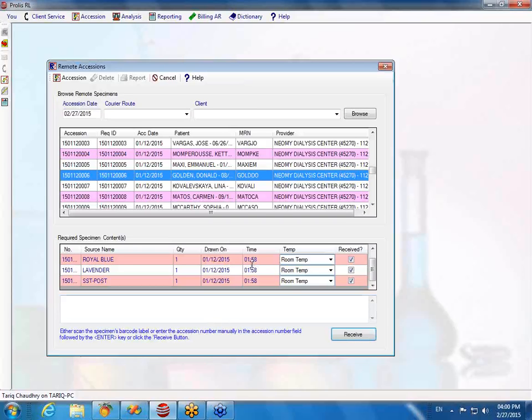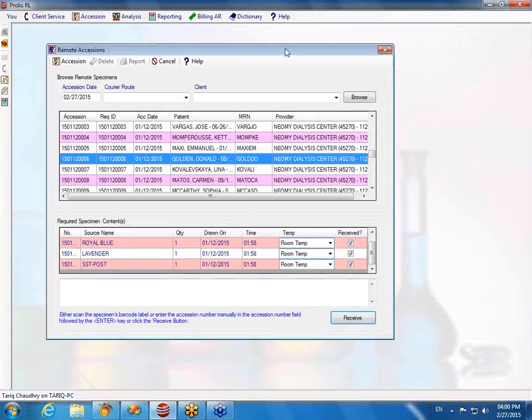I'm going to have a more detailed discussion with you on what we're trying to do on it. So, do you own this company or the product, or what's the deal? Yes, I own it. All right. And this is built on what? What platform is it using? What's the backend database? SQL Server. It's a .NET app? It is .NET. Yes. Okay. Do you have like a web version?